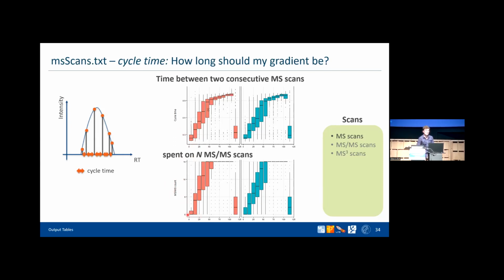So in the beginning, there are always no peptides, and then both jump extremely high all of a sudden. What that means is that in the beginning you have almost nothing, and then everything in one bunch. Your machine can't work that fast, so your cycle time goes up, and that means you get fewer data points per peak, basically.